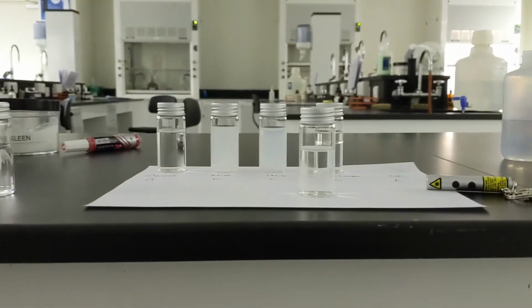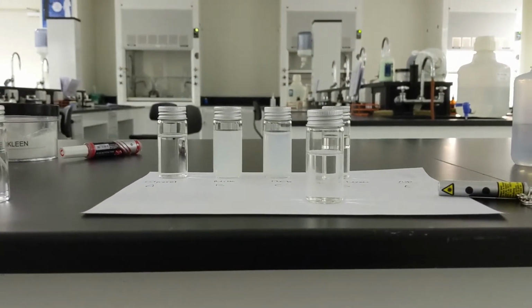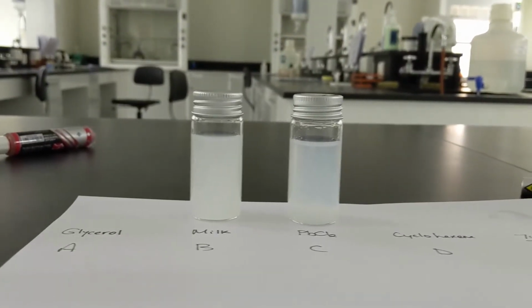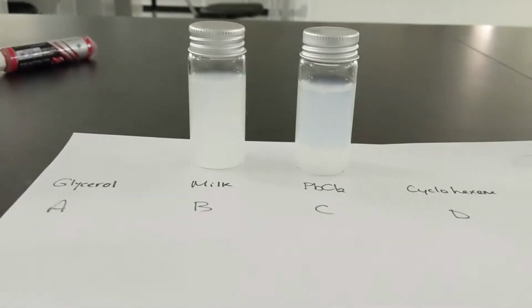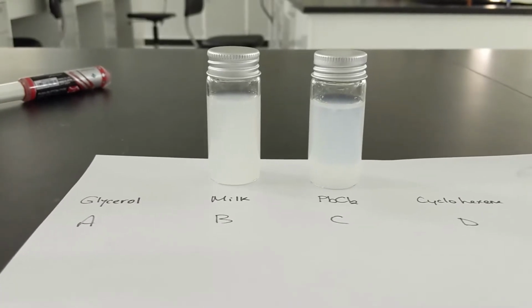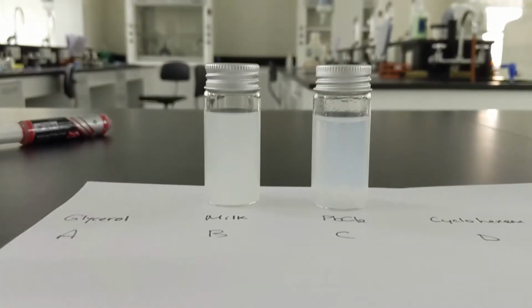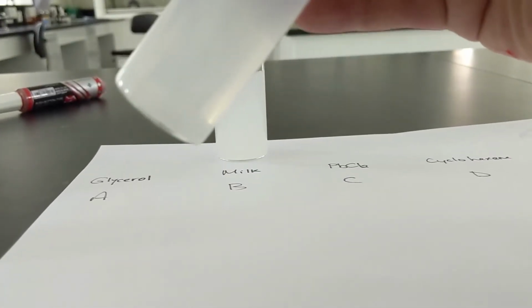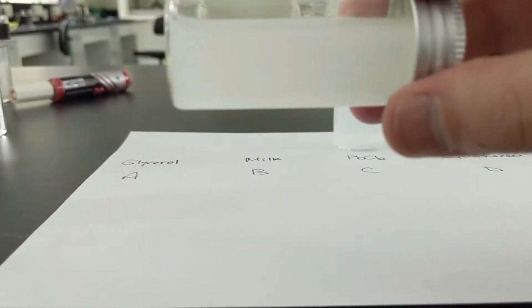I'm going to talk about suspensions versus colloids, and there's only one part left of this experiment. So I just really want to take a minute and focus on these two particular mixtures, milk and the lead-2 chloride. I have let this sit for about 5 minutes, and you might be able to notice something happening with this compound in particular. Can you see the bottom of that? This isn't a beaker, but a vial. In the bottom of that vial, I'm starting to get sediment. Sedimentation is happening. The milk still looks almost identical.